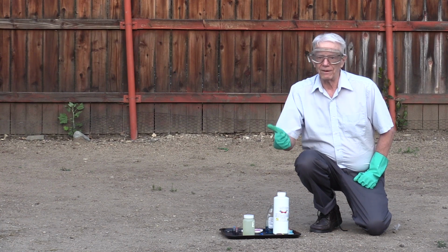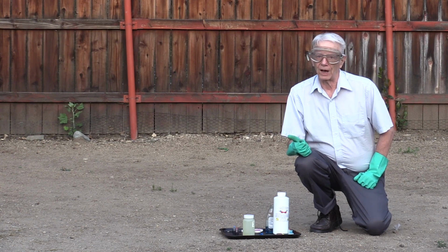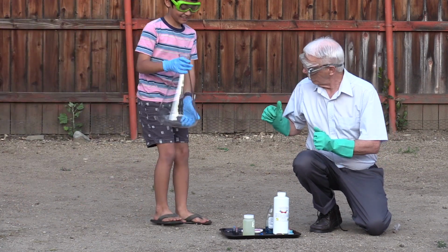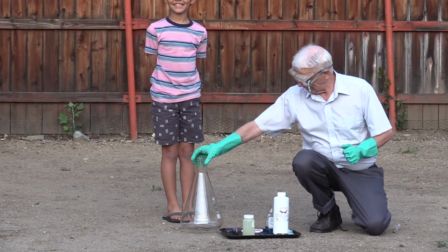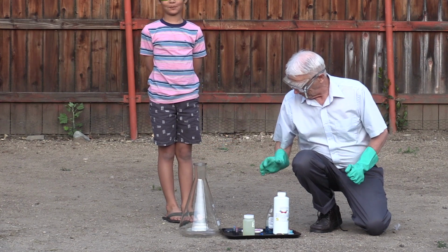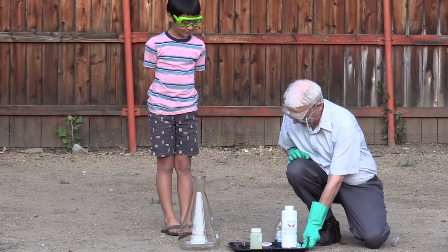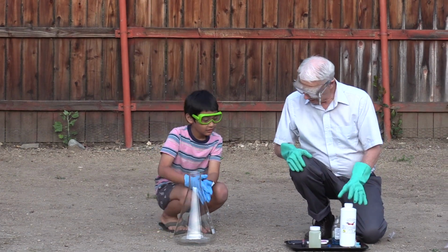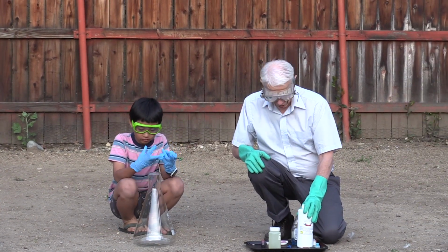I need a 5-liter Erlenmeyer flask. I wonder if there's one around here someplace. Oh, my assistant brought in the 5-liter Erlenmeyer flask. Thank you so much, assistant. Now, I'm going to move this off a little bit and explain what I'm going to do.